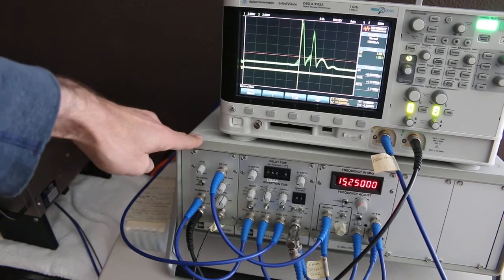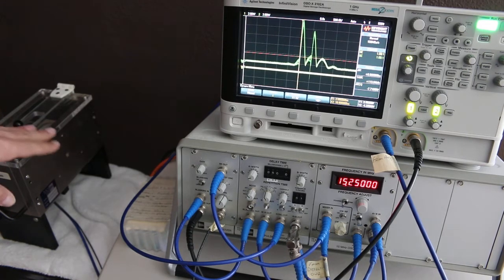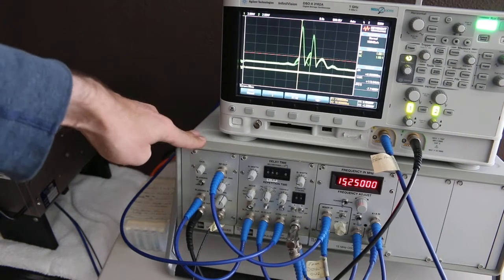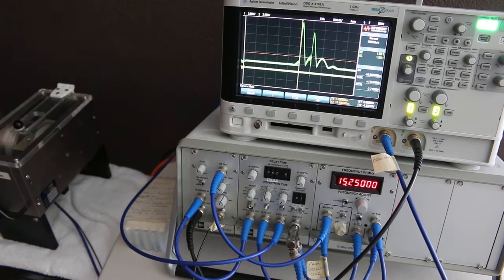Part one over here is called the 15 megahertz receiver. And the 15 megahertz in NMR is intimately tied to the magnetic field strength that exists inside the sample holder over here, which I'll give you a tour of in a minute. That's why it's at 15 megahertz. I think those numbers will make sense to you soon. But what is in the receiver here is at 15 megahertz, it's called RF radio frequency because it's sort of in the megahertz there.